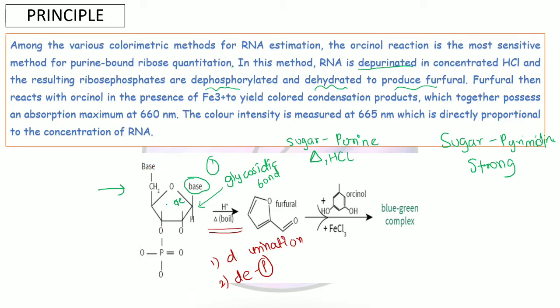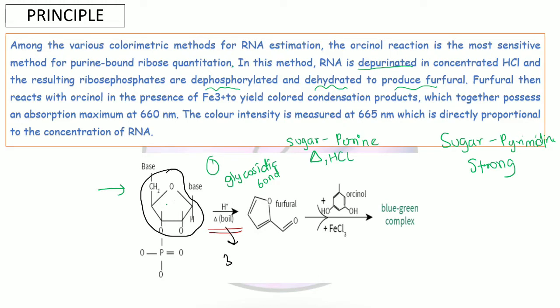sugar, right? Now this sugar undergoes dehydration, and on dehydration there will be formation of an intermediate which is termed furfural.